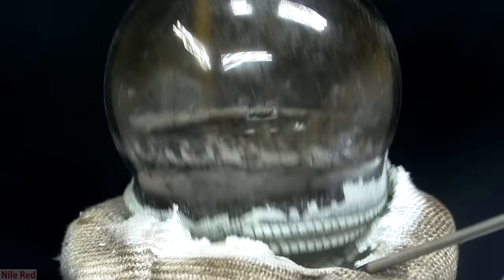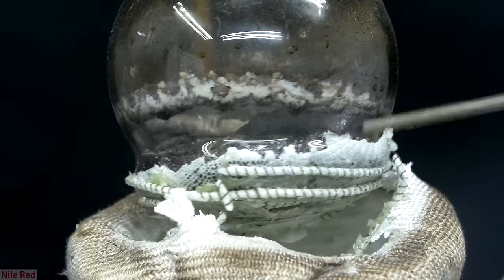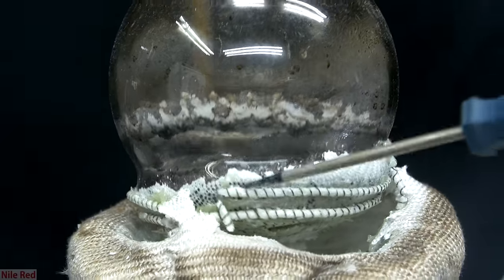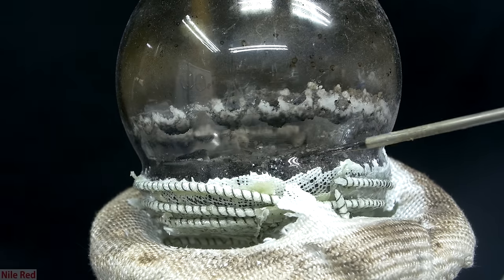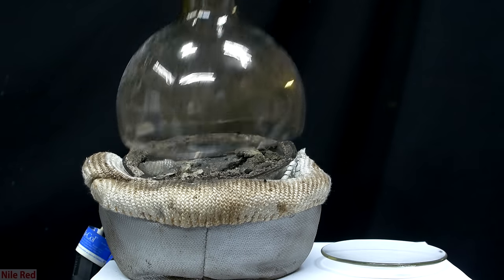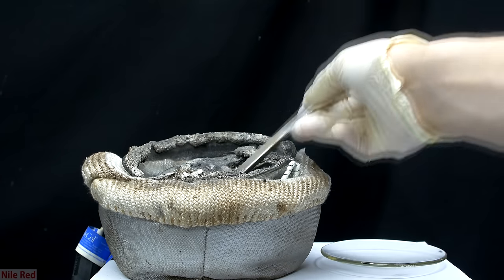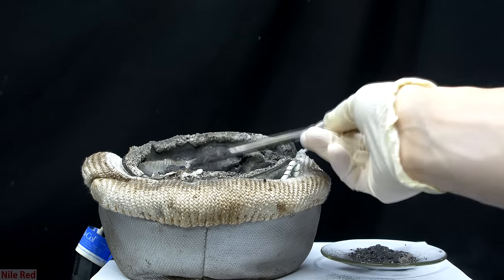On a very sad note, this experiment actually destroyed both my heating mantle and my 1 liter round bottom flask. I really didn't know my heating mantle was capable of this, considering I wasn't even near max power, but apparently it can melt glass. As the flask cooled, it actually cracked in half, and I guess this kind of made it easier for me to get inside. Anyway, I used the spatula to scoop out a little bit of the black powder, and I put it on a watch glass.